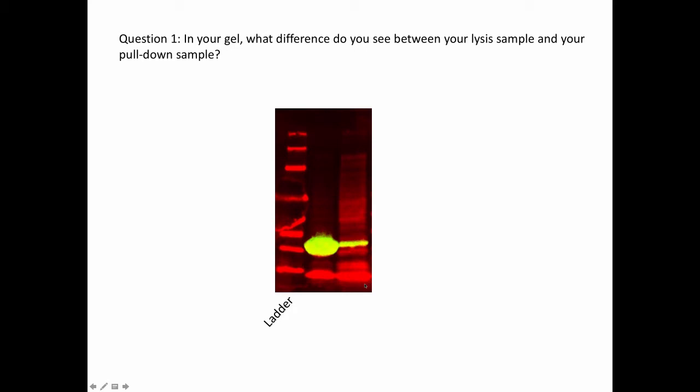Here is your Western blot. What you're looking at is a dual-color Western blot, so you're seeing stains in red which is showing your revert total protein stain. The red is showing all the proteins on the blot, and the green is showing your FITC anti-GST antibody. Remember we use direct immunodetection to detect only the GST in the sample. Your gel was run with a ladder that you can see here, and you should have a lysis sample which looks like a smear of proteins, and then you should have your pull-down sample. This is your pellet sample where you purify your GST protein and you eluted them off of the glutathione agarose beads.